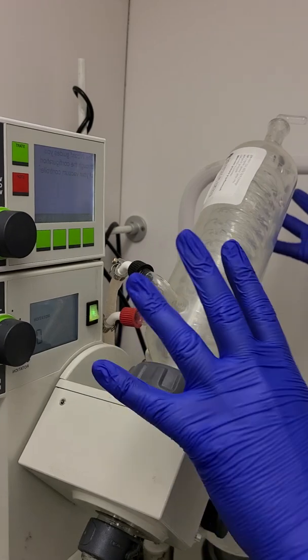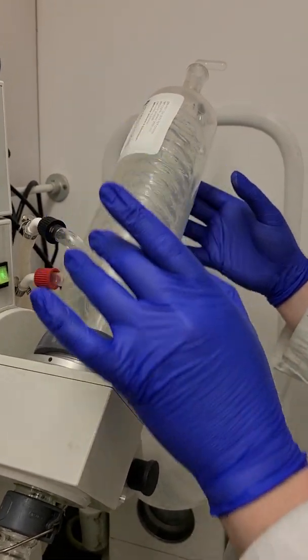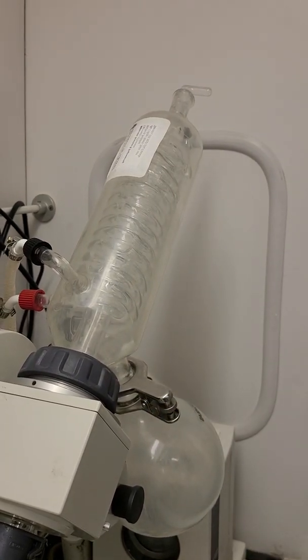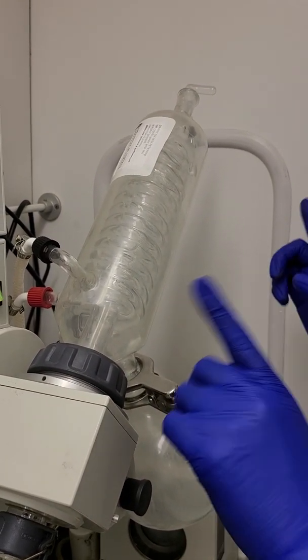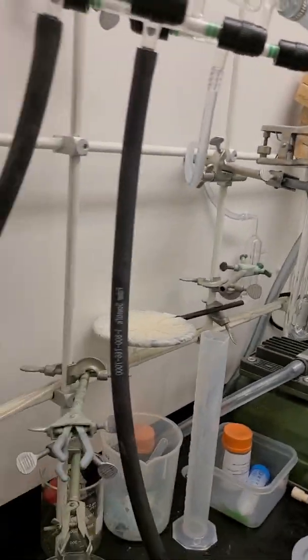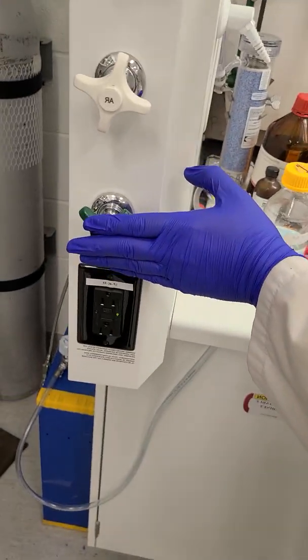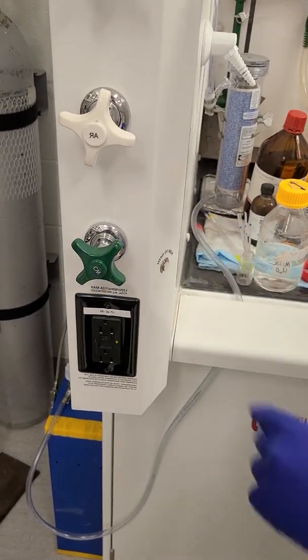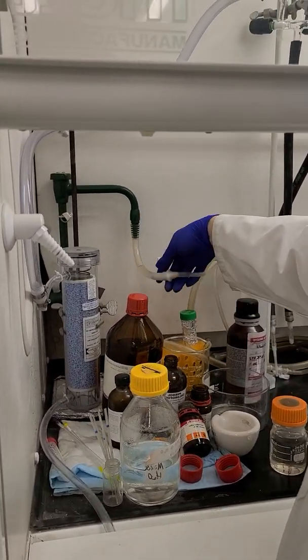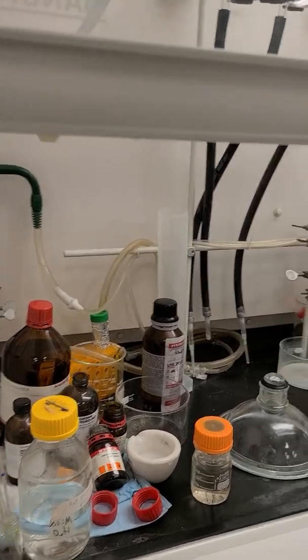Now let's talk about the actual condenser. Here is the column condenser. It has the coil on the inside, which has a water source. The cold water source, come out of the fume hood for a second. The cold water source is right here to the right of the fume hood, and this is the tap. The green tap here is where the water comes out. There's this tubing with an adapter to this smaller tube that connects to the condenser inlet.